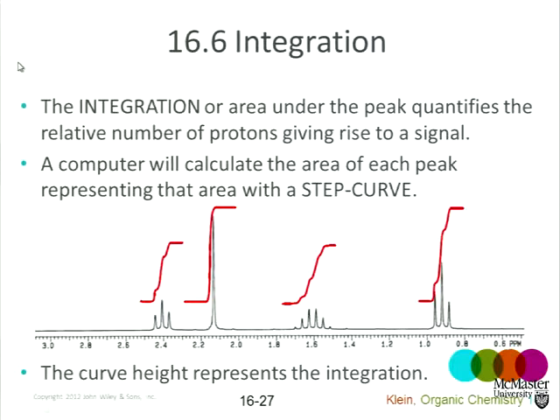Okay, so integration is the opposite of that, and you probably do it in math, some god-awful math course here at McMaster, right? Okay, so integration is measuring the area under the peaks, and these red traces sort of essentially plot out the area under the peaks.